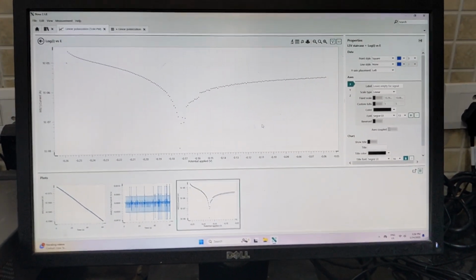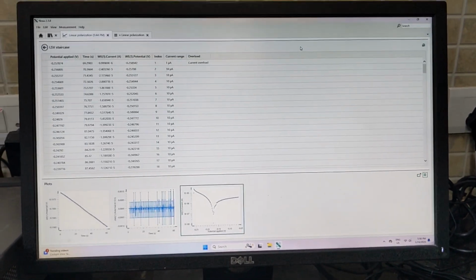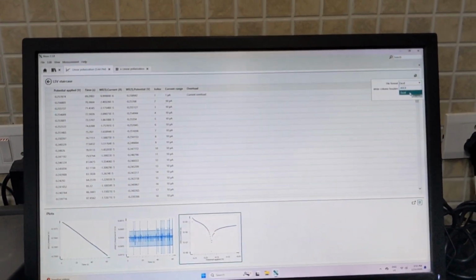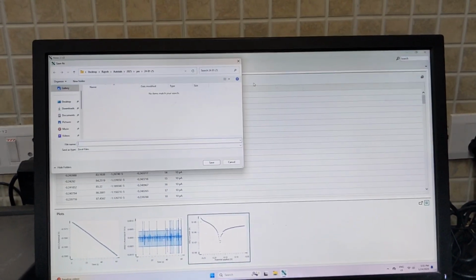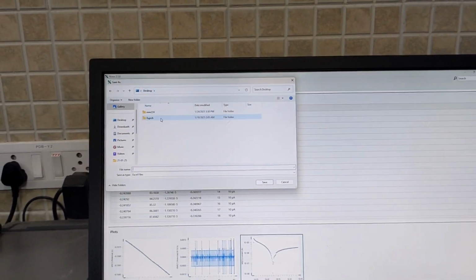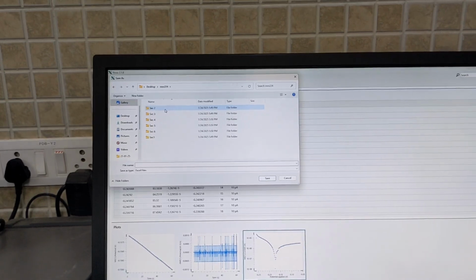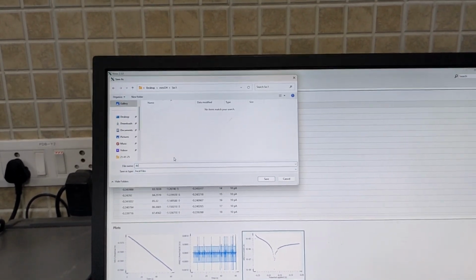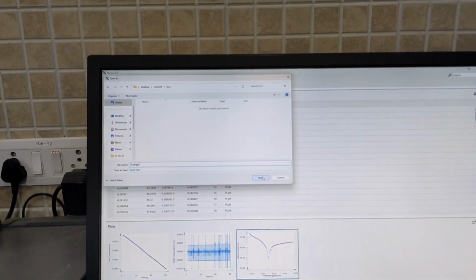Once the procedure is done, then click on this icon to save this file. In the format, select Excel, then export. Then on the desktop there is a folder MM224. Go to your section, save by one of your batchmates roll number and click save.